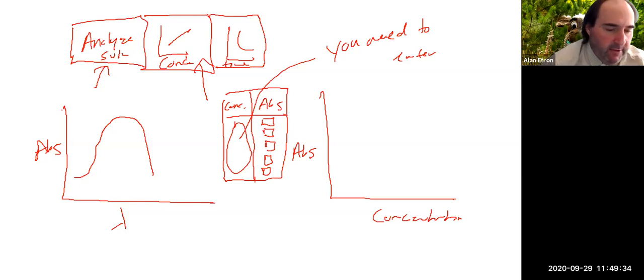So the ultimate goal, part 1, is you're going to use that information that's provided to you along with your calculations from the table, and you're going to basically make a standard curve for these standards where iron is your limiting reagent. So the amount of iron that you start with is the same concentration as your product at equilibrium, your complex ions. So again, in part A, that is the way it's set up.